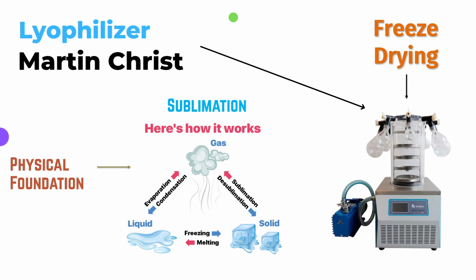For the process of sublimation, there is a requirement of a vacuum environment which will be created by the vacuum pump. So the function of the vacuum pump is basically to create a vacuum in the system, which is required for the sublimation process, where there will be conversion of a solid directly into gas by omitting the liquid state.